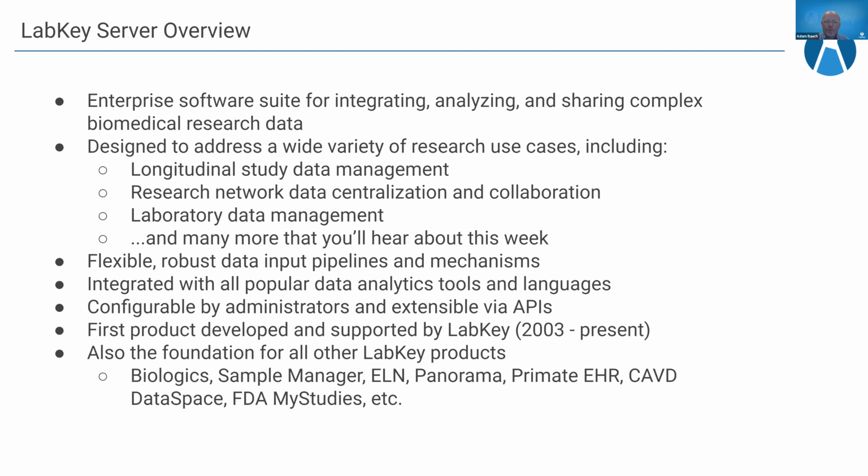LabKey is also very configurable by administrators. Again, with 500 clients using a single product, it needs to be very configurable to work with all the different types of research going on. And then likewise, as Michael mentioned, LabKey is very extensible via APIs. Developers within our client organizations create modules, add JavaScript, custom pages, and customize LabKey in a variety of different ways through the extensive APIs that are provided.